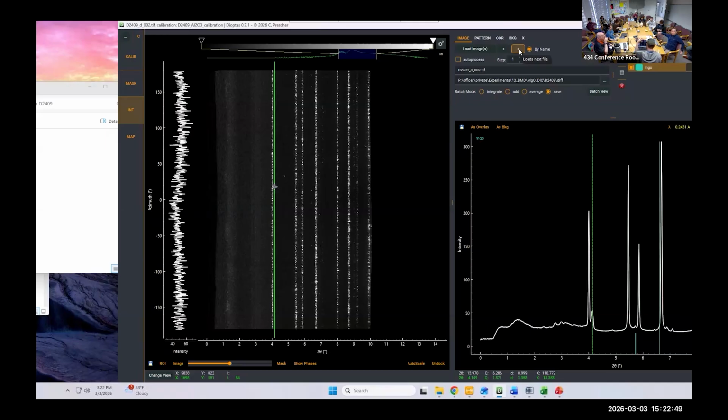So we have the boron nitride sleeve and the furnace, but before we start, we want to calibrate the distance of the detector away from the sample. You can think of it as making a diffracting cone, and where it shows up on the detector depends on how far away the detector is. Imagine you went up like this and your detector was here, it'd be here, but if it was further back, it'd be up here. So we want to calibrate what the distance of the detector is.